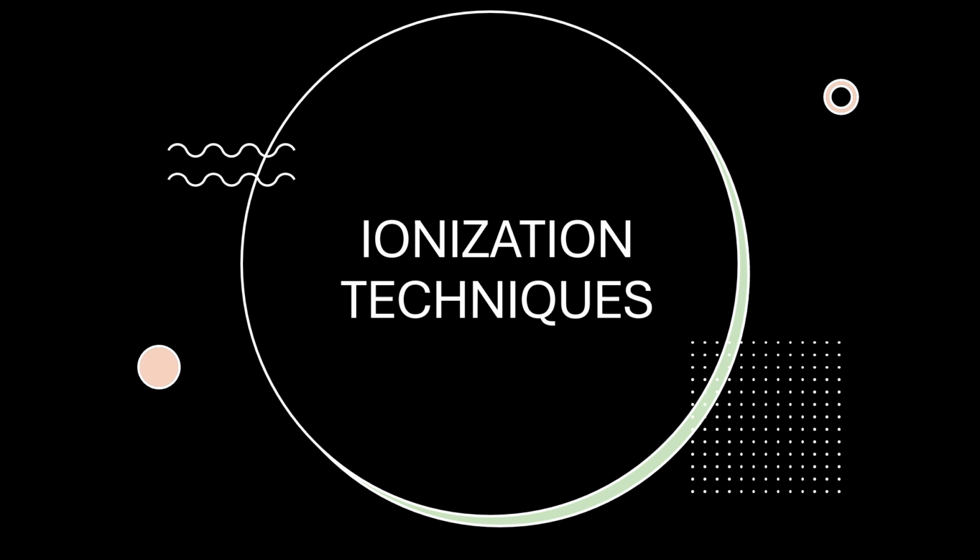Hello everyone. So today I'm going to talk about something that's absolutely fundamental to mass spectroscopy, that is ionization techniques. We'll be covering the major methods like APCI, EI, ESI, and several others. So let's dive right in.